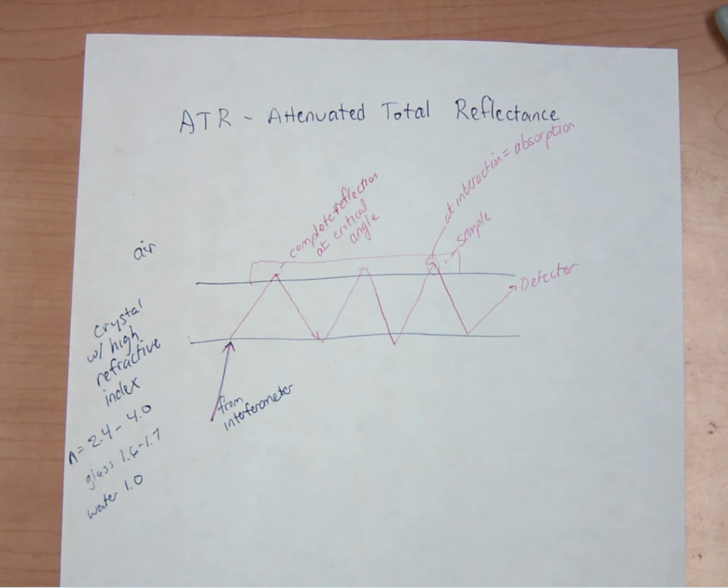Alright, so that's a little bit about our ATR sample holder, and that's the last piece of the instrumentation puzzle that we needed to complete FTIR.